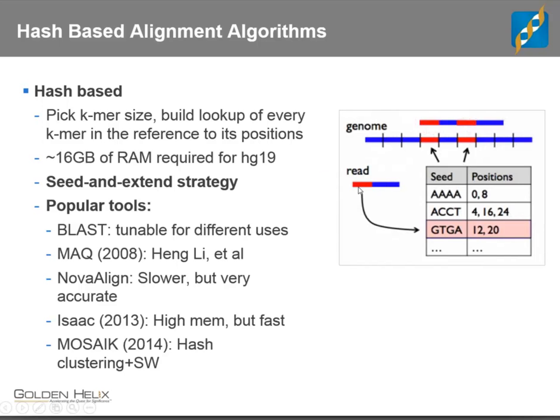What about the rest? Then you have to do something like a local pairwise alignment with the Smith-Waterman approach, or something even more simplified than that. But that is the general strategy that has been used and extended and optimized over and over again. And in fact, even modern algorithms coming out just this year, I'll touch on these later, are doing much the same thing. They might not be using hash tables. They might be using things we'll be talking about later, but it's much the same strategy.